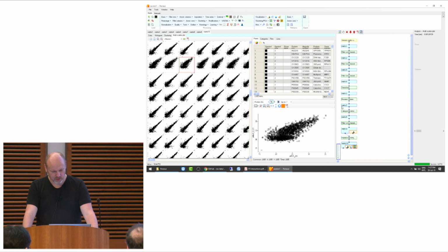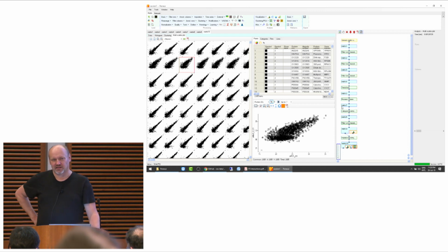I mean, this would then do a t-test against something else somehow. What would be your control samples? Would it also be the remaining organelles in this case? Control samples would be organelles with no treatment. The same organelles. But okay. Treatment, no treatment with exactly the same kind of organelle, basically. And then with the treatment, you have a contamination, and without the treatment, you don't have the contamination? Hopefully you never have it. But yeah, in some cases, you do have the contamination, let's say, with the treatment.